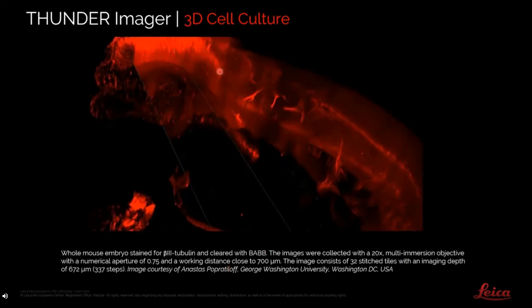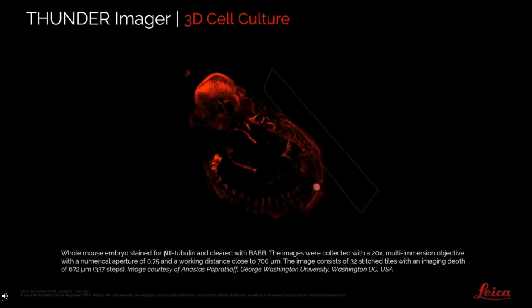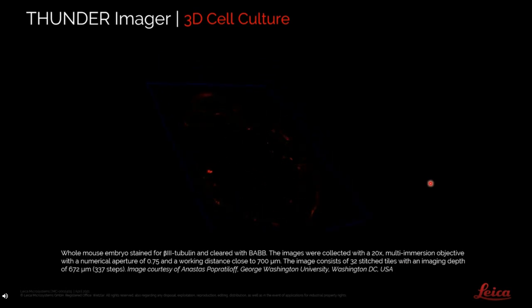And you can see before Thunder, we have a lot of out of focus light. And then after Thunder, our image quality is greatly improved with large volume computational clearing.